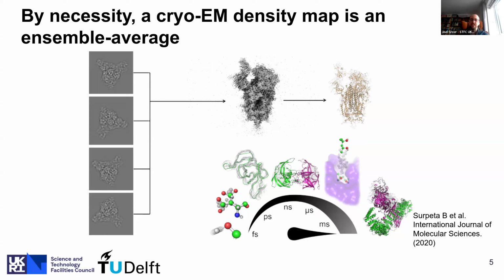So proteins in a cryo-EM sample may be expected to be sampling both the main discrete, lower energy conformational states of a protein, as well as the transitive, maybe higher energy states between them at room temperatures. As long as the sample is flash frozen in vitrified ice quickly enough, we expect to be able to see motions of timescales longer than the freezing process in our cryo-EM sample.